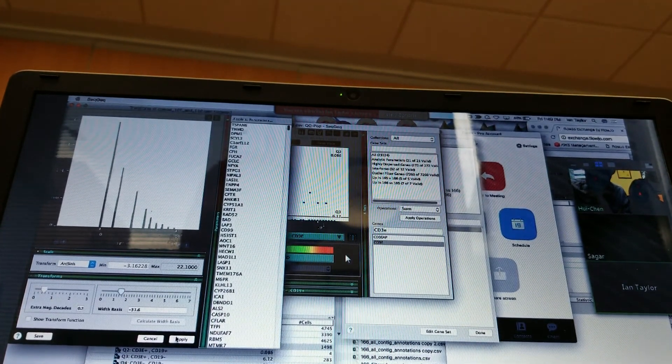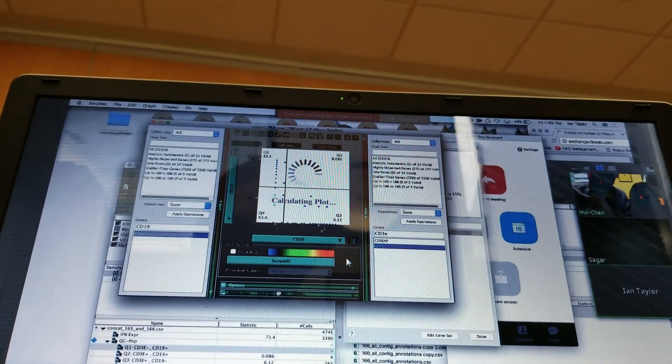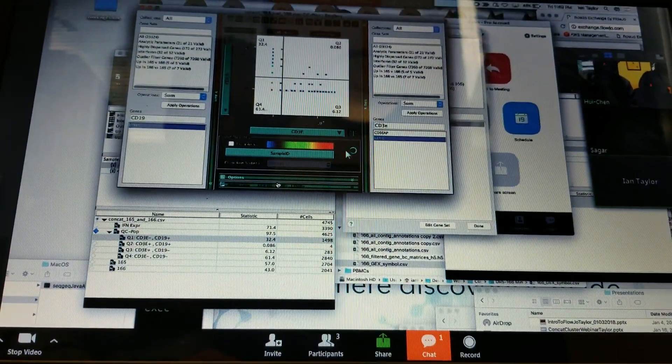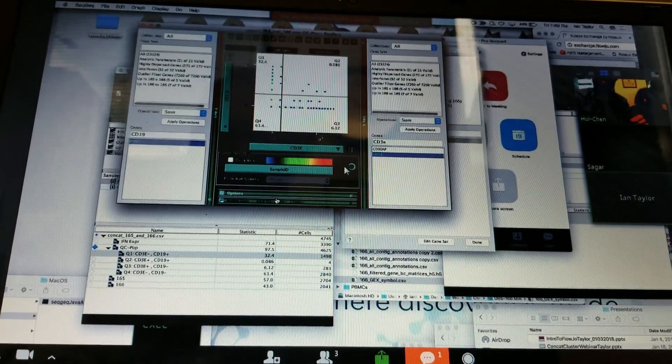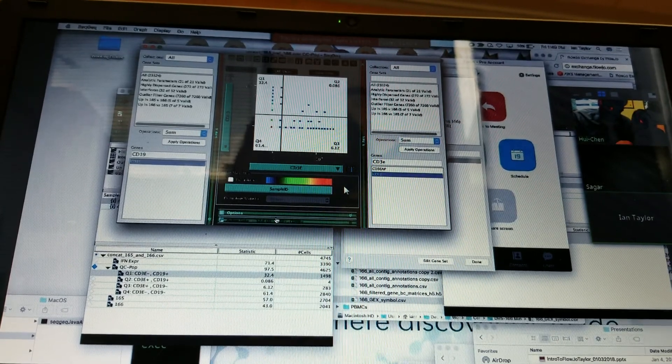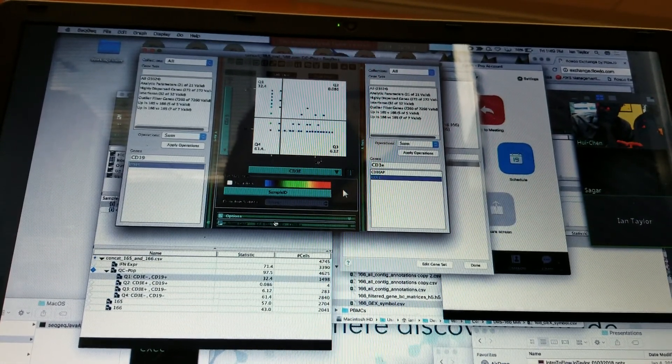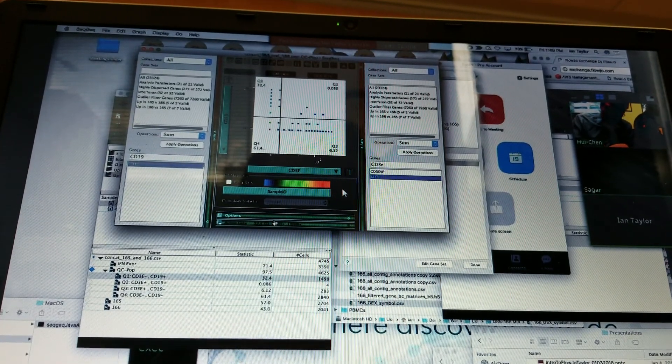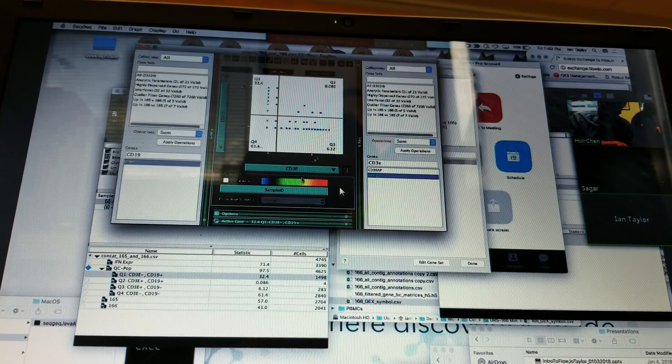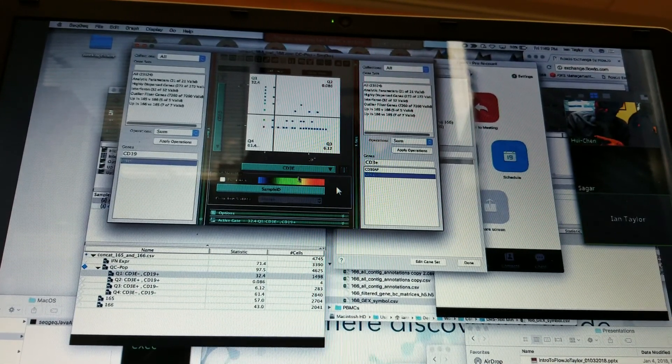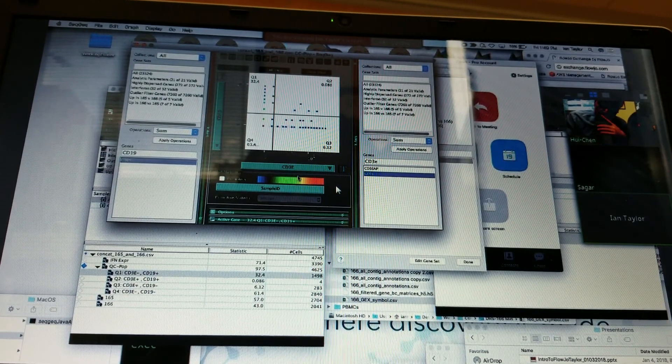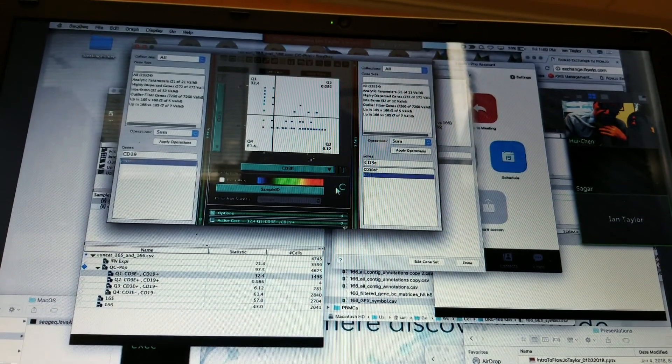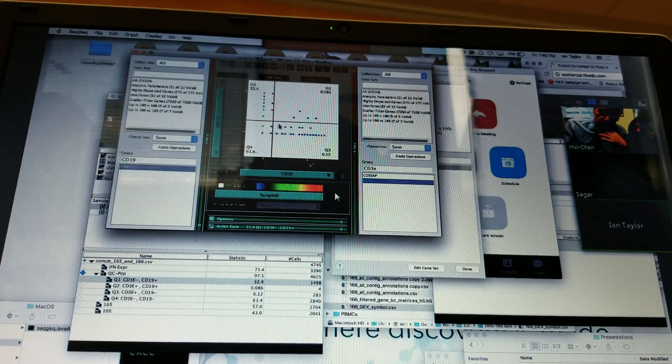You know, when you do it, you touch CD3Epsilon, right? You touch the axis. And that's how, because I tried some of this, and sometimes it doesn't switch. And I don't know, I actually don't know what to do to turn the program in. Like, touch this axis, and then what happens? Can you go through that, just like for CD3Epsilon? You can touch that, turn that on, right? Can you do that a little slower? You touch CD3Epsilon, and then what's, is that what you're doing? Let's see if I got this right. You guys are just, you know, a little bit hard to hear. It's coming in a little bit choppy, so I apologize if I have to read these things. But I think what you asked is, how do I bring these events off of the axis?